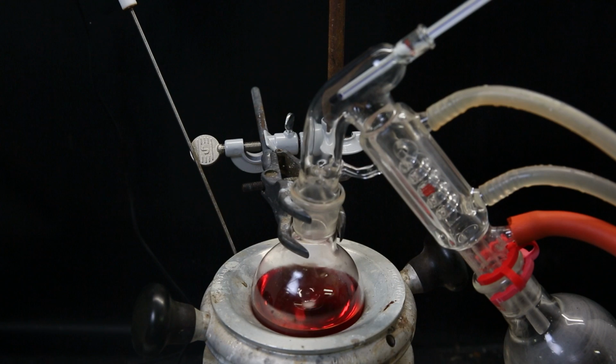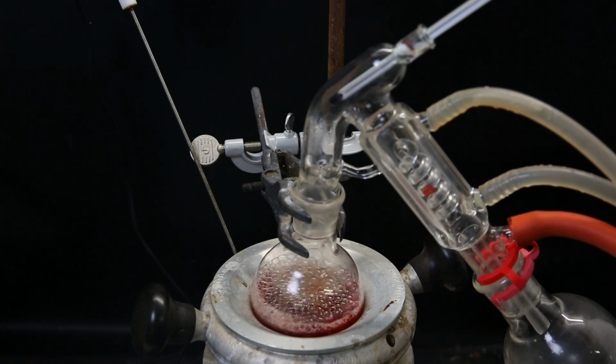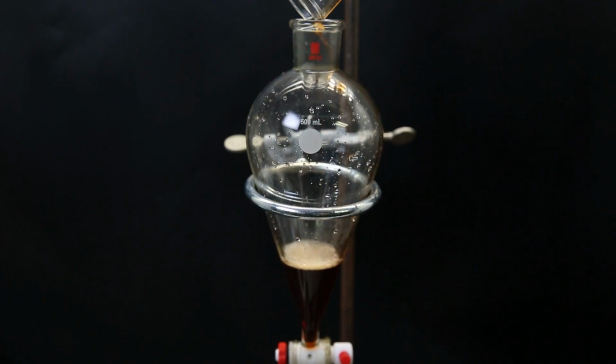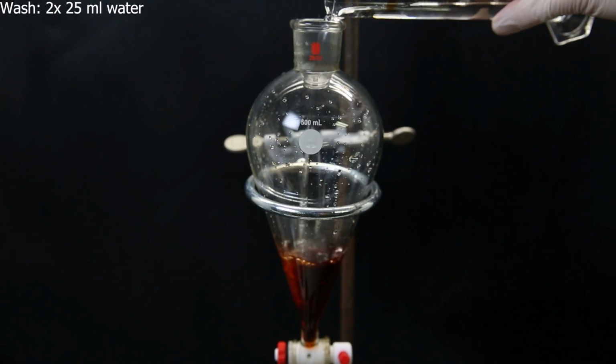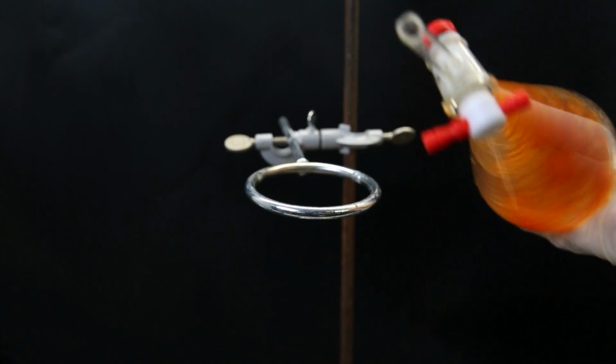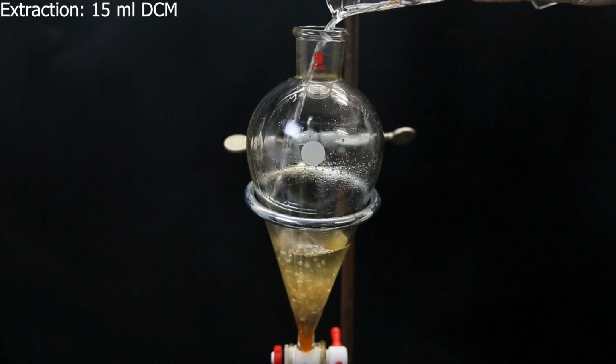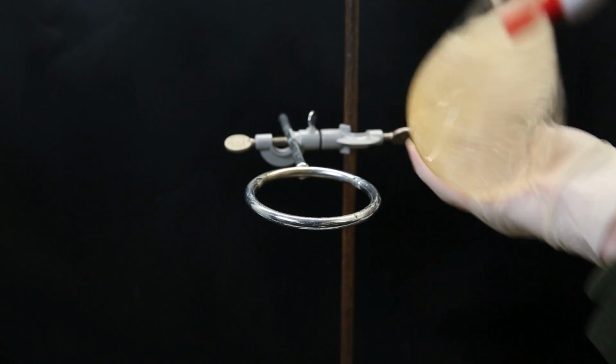I then attach a short path distillation apparatus and concentrate the solution. I then move the concentrated solution to a separatory funnel and wash it twice with 25 ml of water to remove remaining urea. I then extract the water layer once with 50 ml of DCM to take out any product that might have moved into the water layer.